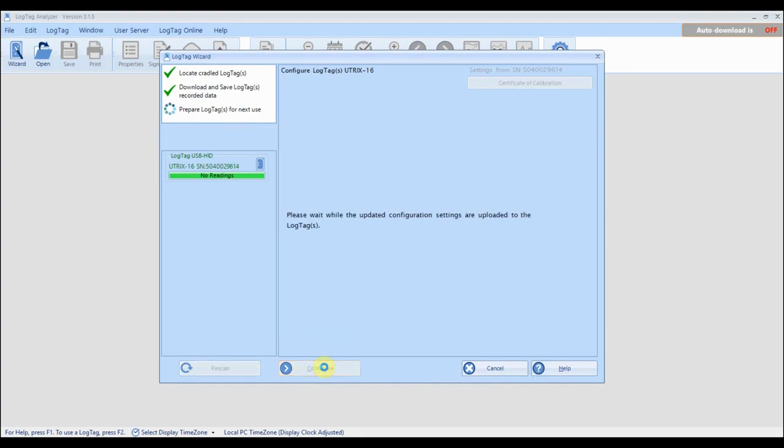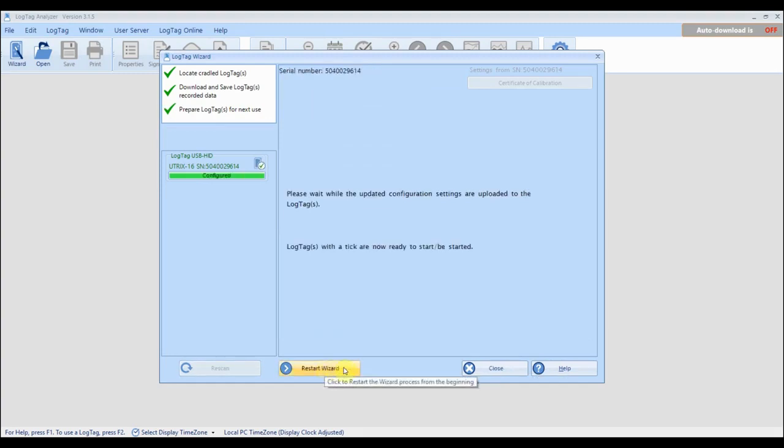Once you are ready click configure and the wizard will configure your logger with the settings you entered. Once the wizard has finished you can click close.